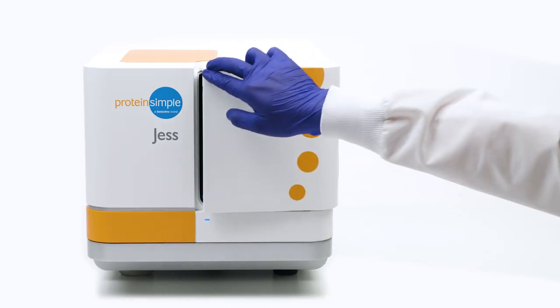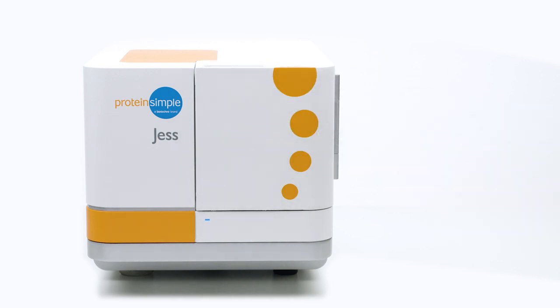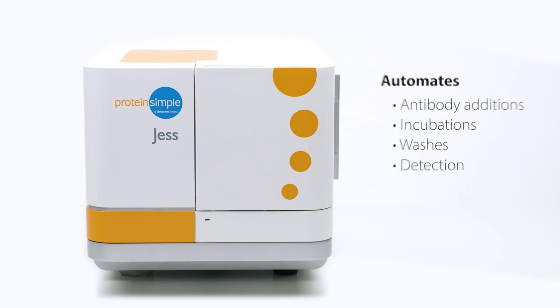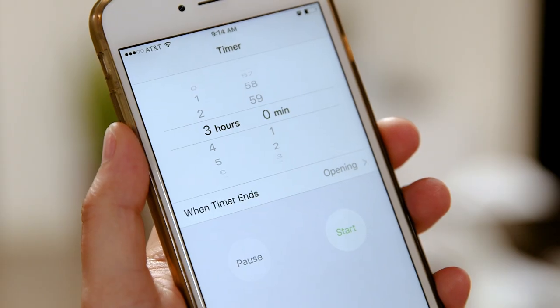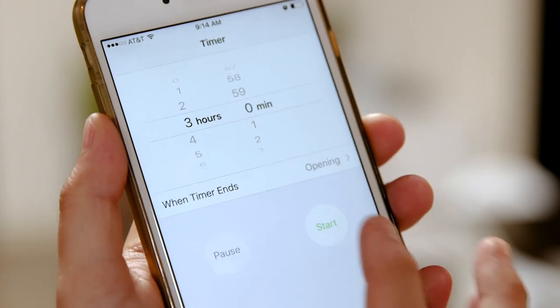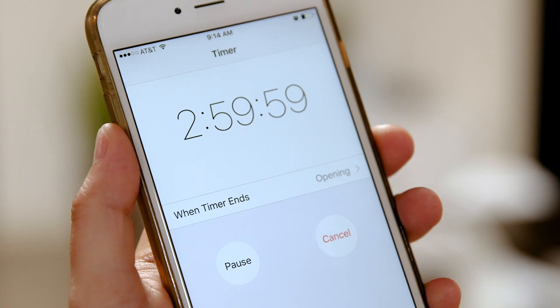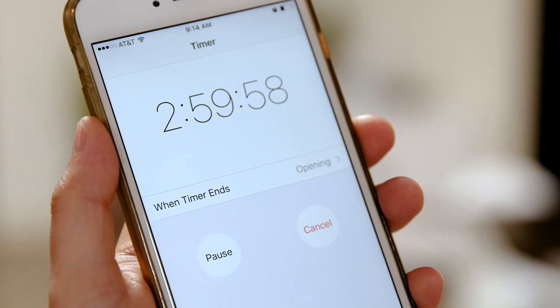She separates your protein by size and precisely manages antibody additions, incubations, washes, and even the detection steps. Come back to fully analyzed and quantitated results in three hours.